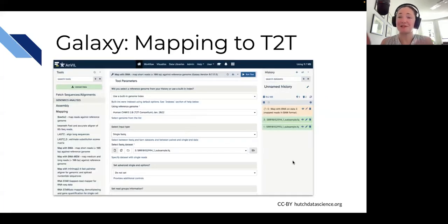Okay, so one of the reasons we might want to use Galaxy and redo this analysis ourselves is because this particular study, Corey et al., that I just talked about, used the HG19 reference genome. And so you might say, okay, maybe I want to take a look at some of these data, but I want to align them to the new T2T consortium reference genome.